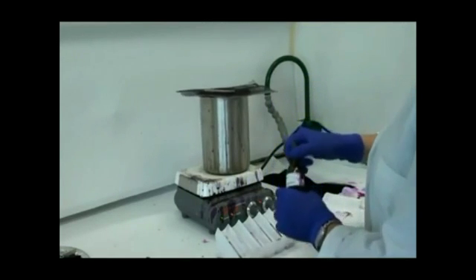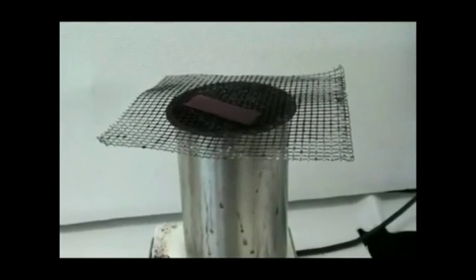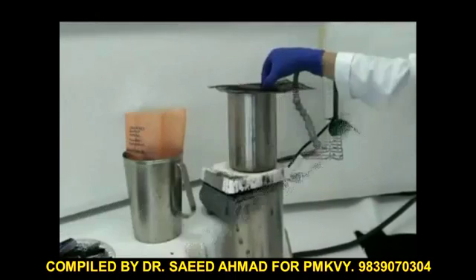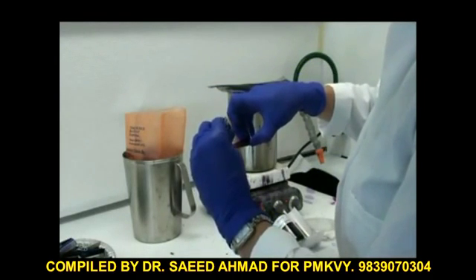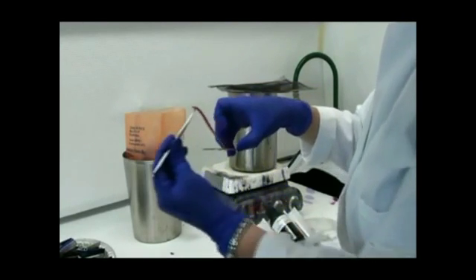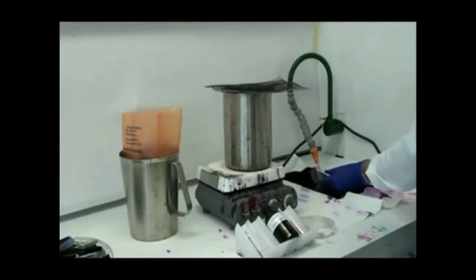Now I'll let that slide heat over the water bath for 3 to 5 minutes. If the blotting paper begins to dry out, reapply more stain. Once this first step is complete, I'm going to remove the blotting paper and discard it. Then I will rinse the slide until the water running off it is completely clear.